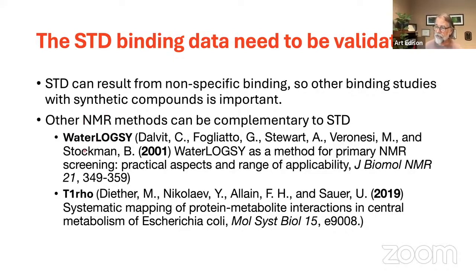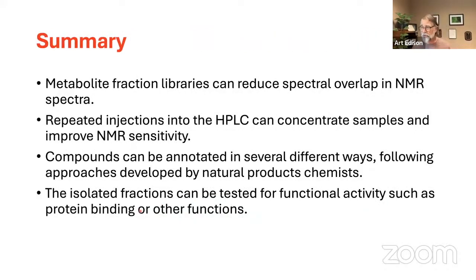For example, there's something called water-LOGSY, the reference is right here. This is a really nice alternative to STD, and we've been running them with STD now. T1-rho is another experiment, and a reference for that is shown here, applying this to protein-metabolite interactions in E. coli. So this is the last slide.